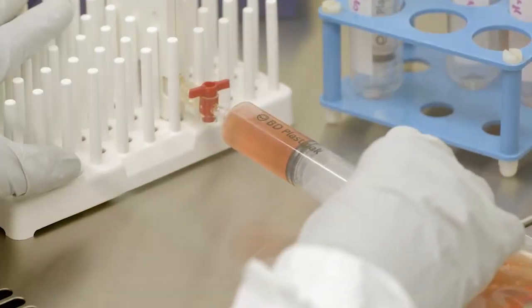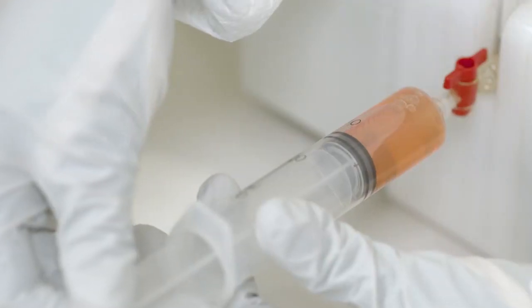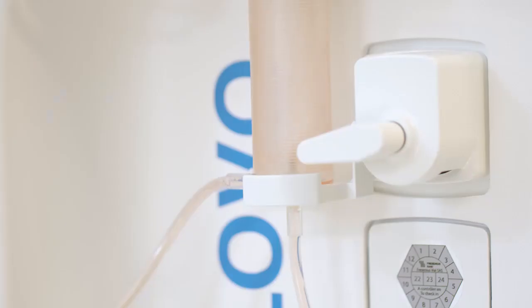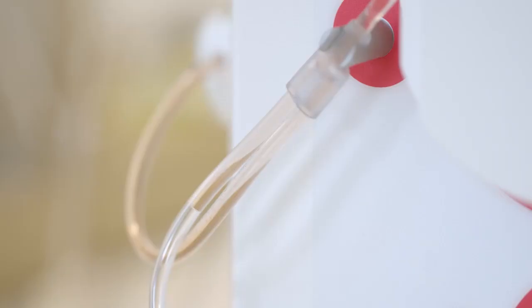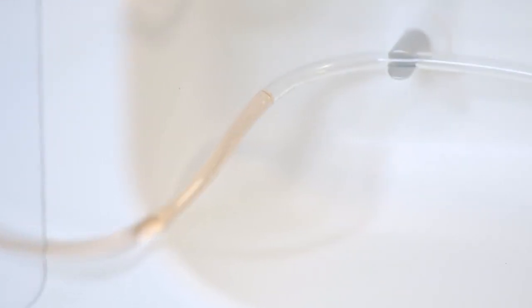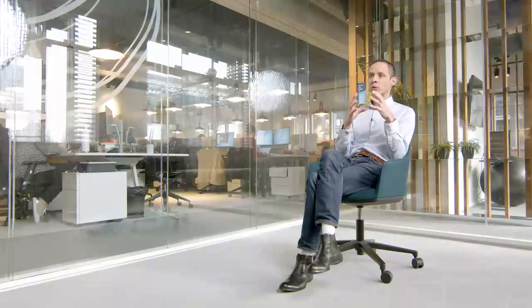Every time we try to use the same global backbone and the same unit operations. However, we also need to fine-tune them depending on the product. And that fine-tuning is very dependent on what the analytical methods are telling us. At every step, we look at the cells, we test their activities, and so we are working really closely with the analytical development group because they give us all the methods that allow us, again, to make sure that what we do fits what we want to do.